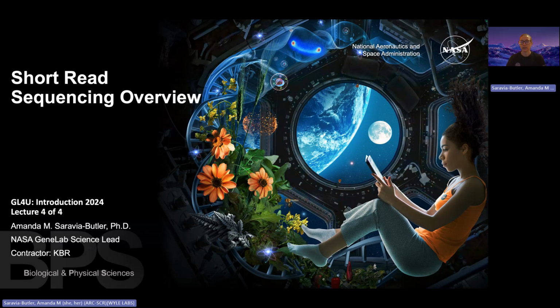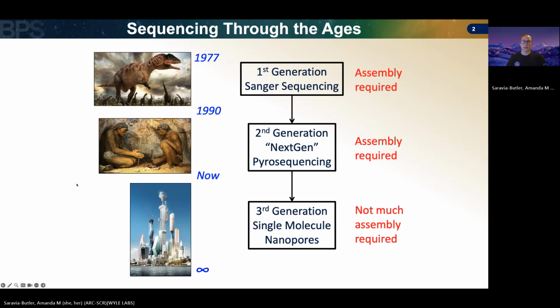Those of you who have completed the previous content, welcome to the 4th lecture. This one is going to be an overview of short read sequencing. So, just a snapshot of sequencing through the ages here.